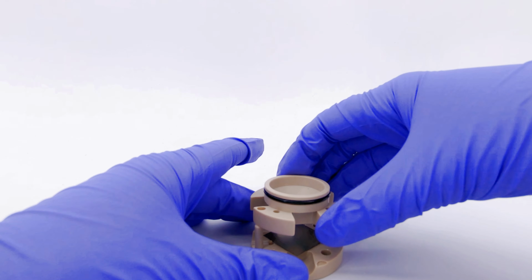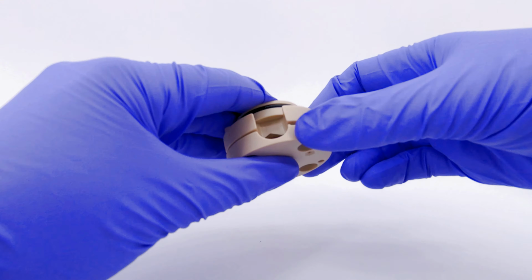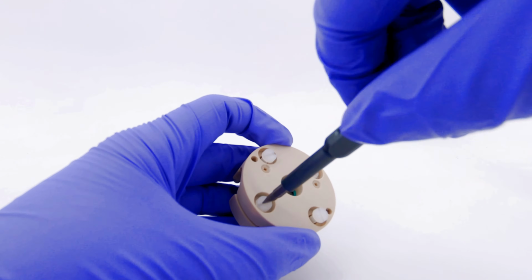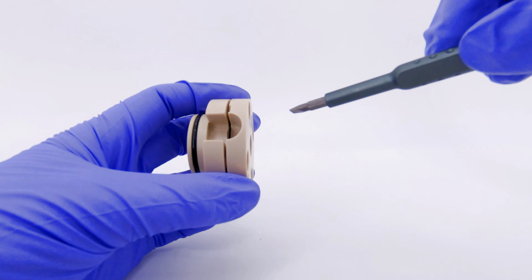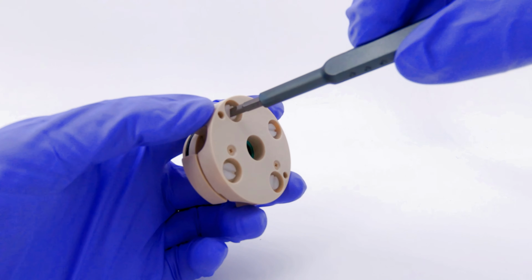Once that's done, carefully position the top half back on, making sure that it lines up with the pins. To secure everything in place, retighten the screws in a cross pattern. Do ensure you tighten them evenly so that there is a consistent gap between the cell halves.